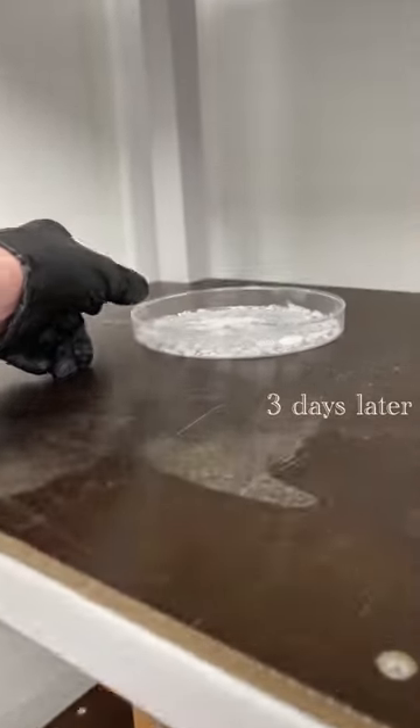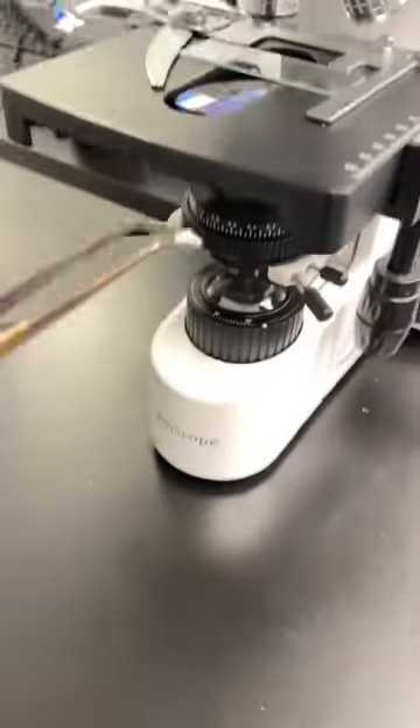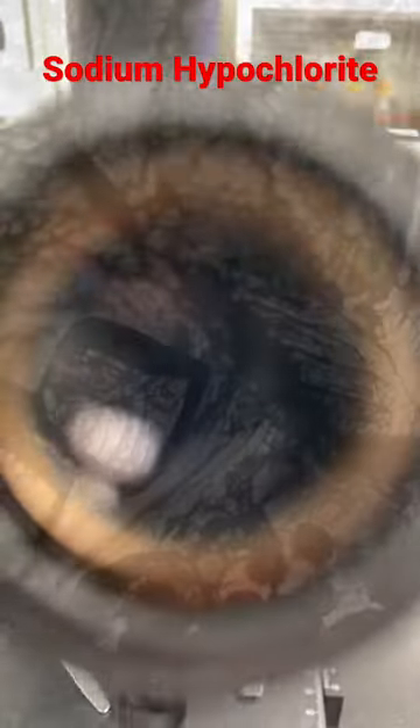When I came back I had some nice little crystals forming. Bleach has a main active ingredient that promotes its cleaning and disinfecting powers. It's known as sodium hypochlorite, and these are the crystals we see here.